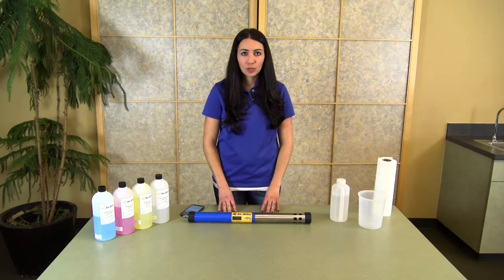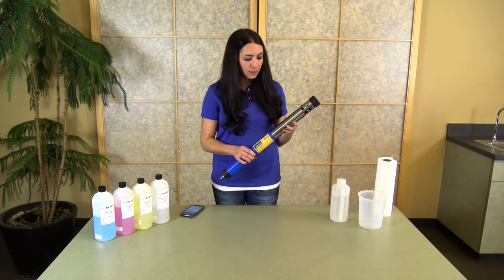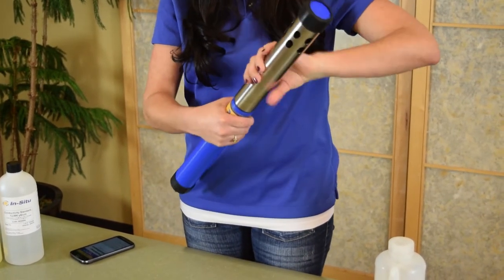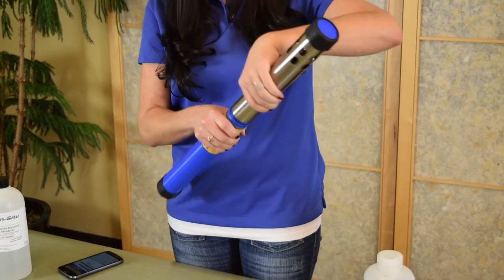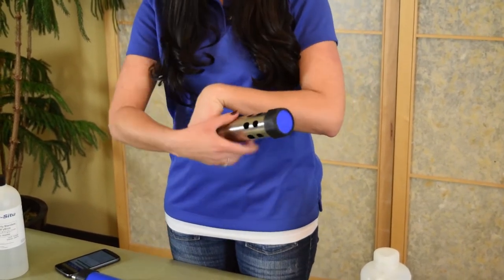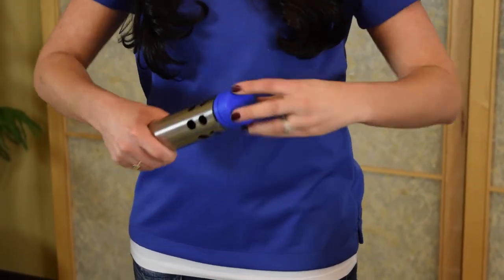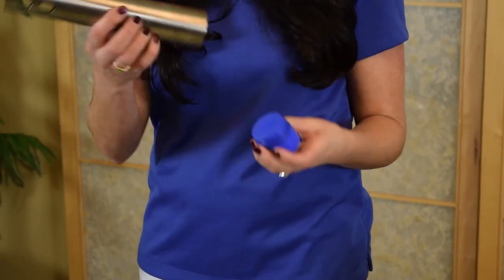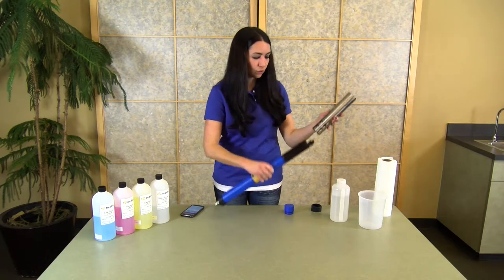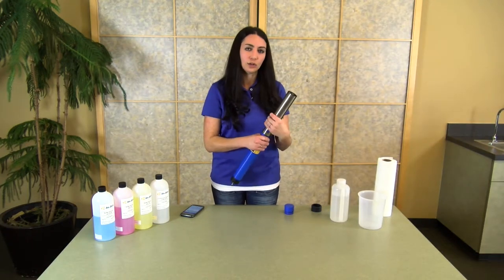To begin your calibration, make sure the instrument is set up in calibration mode. One of the unique things about this instrument is the dual-sided restrictor, which allows you to deploy the instrument but also perform calibrations directly with the restrictor. To put the instrument in calibration mode, remove the restrictor, remove your bottom end cap, unscrew the end cap, and flip the entire restrictor around. Once the restrictor is inserted onto the instrument this way, you've created your calibration chamber.